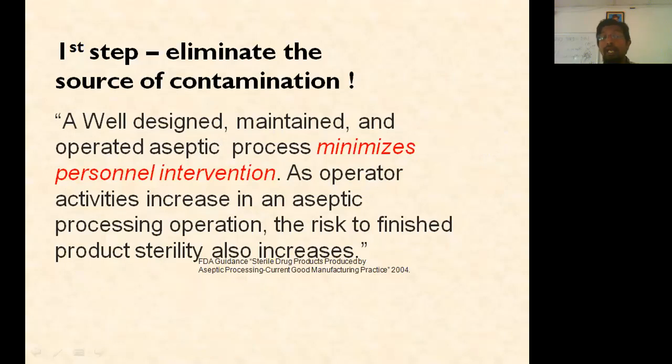A well designed, maintained and operated aseptic processing minimizes personnel intervention. People entering the room should be restricted, minimized, and only authorized persons should enter, again with all those protective clothings, not barefooted, not with open head, not with big beards. Everything should be covered, right? As operator activities increase in aseptic processing operation, the risk to the finished product also increases. If the number of people entering the room increases, the risk to the final product also increases. So you should be carefully monitoring it.